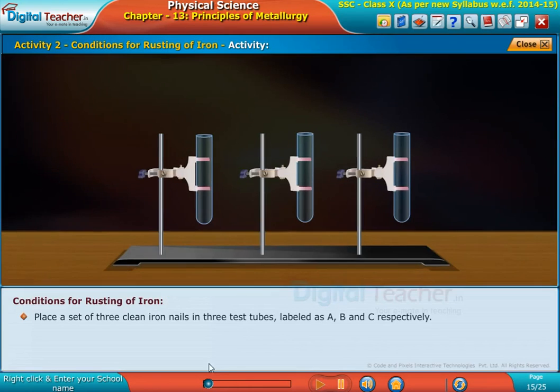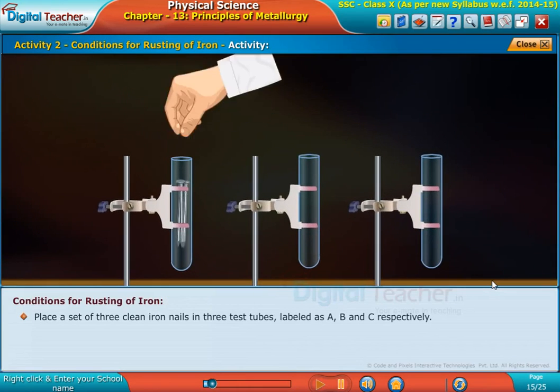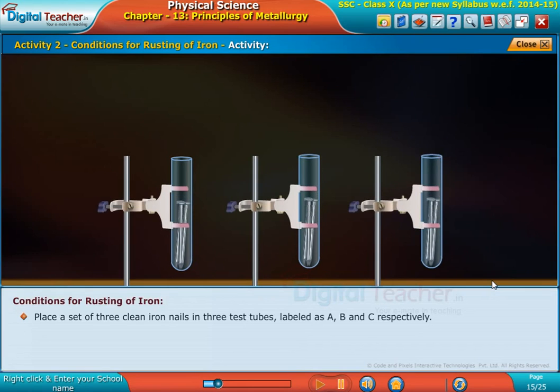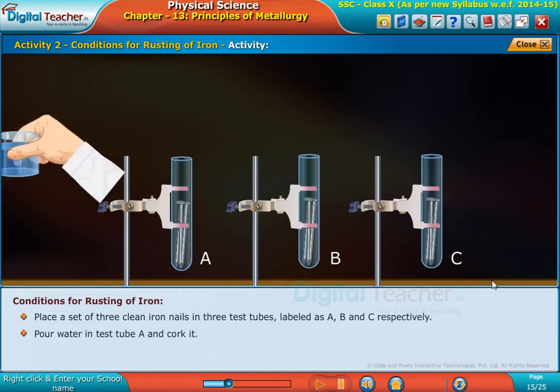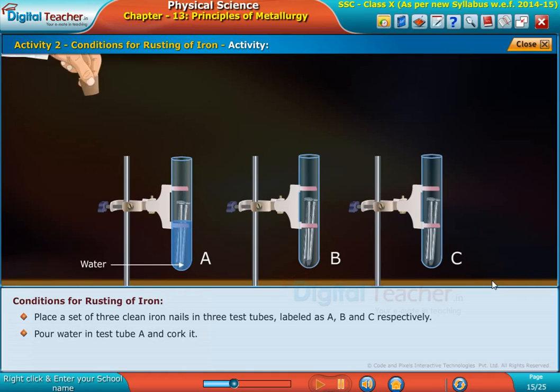Place a set of three clean iron nails in three test tubes labeled as A, B, and C respectively. Pour water in test tube A and cork it.